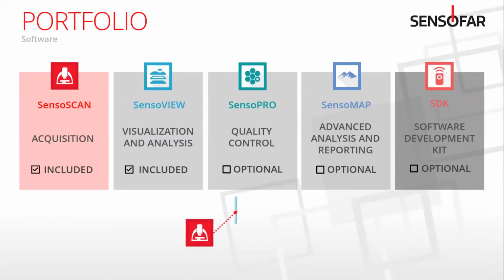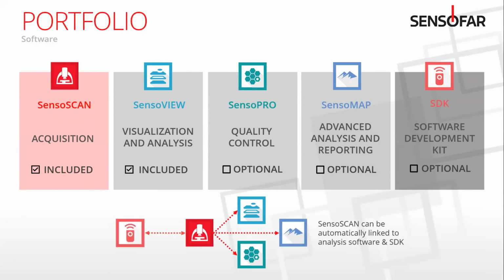So what we're talking about today is the automated processes in which we can inspect, move the stage around, and also then do the analysis. So I just wanted to provide an overview with this slide.